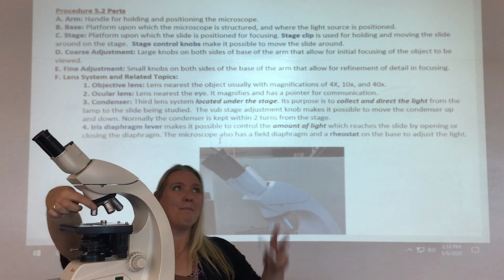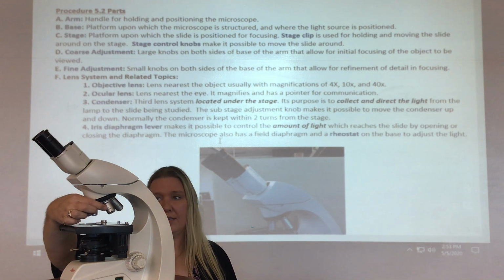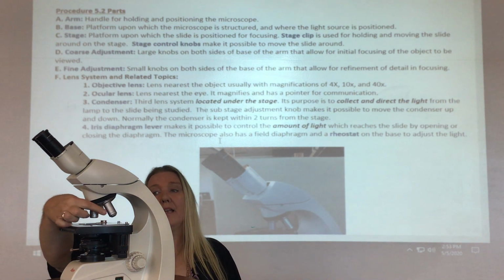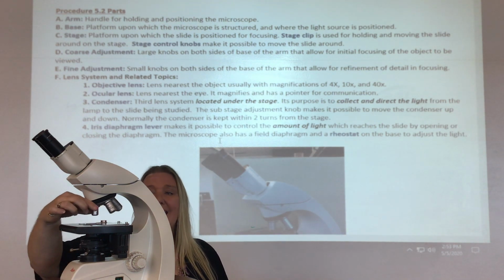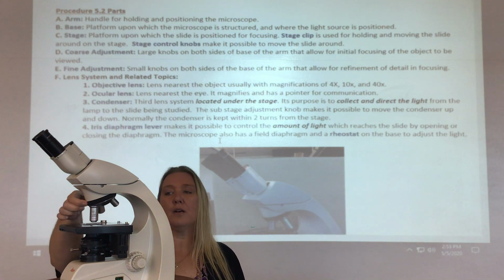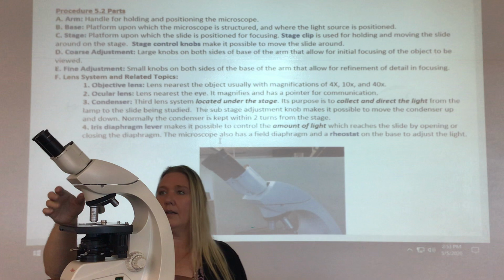Even though it's in the middle size, it's called the low magnification or the low power objective. And then you would go to the highest power, the largest one, and it's gonna have the highest magnification. So start at the scanning, then move to the low power, and then you would go to the highest power for looking at your specimen. We'll talk about magnification again in a second.